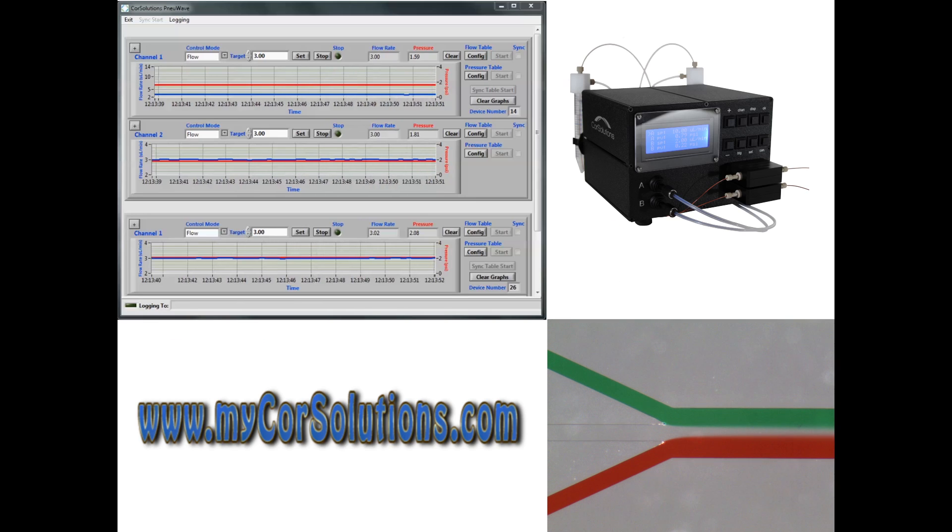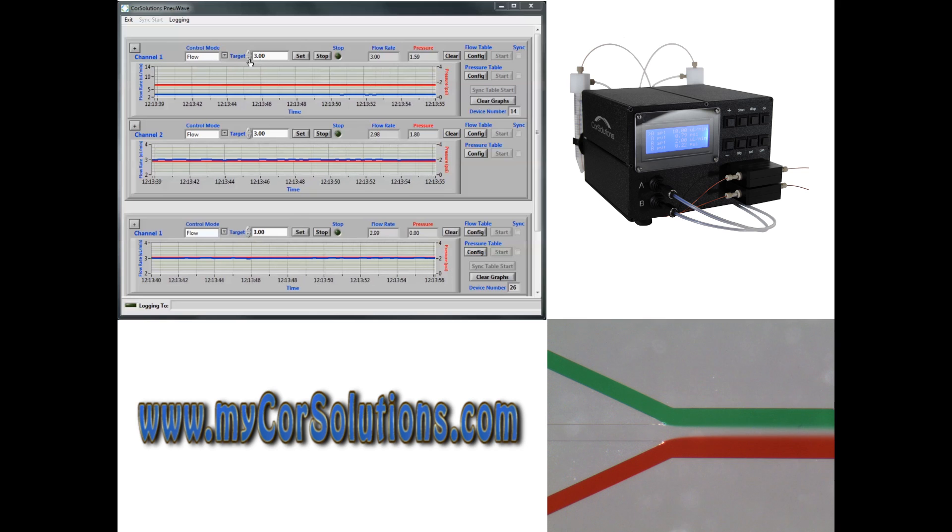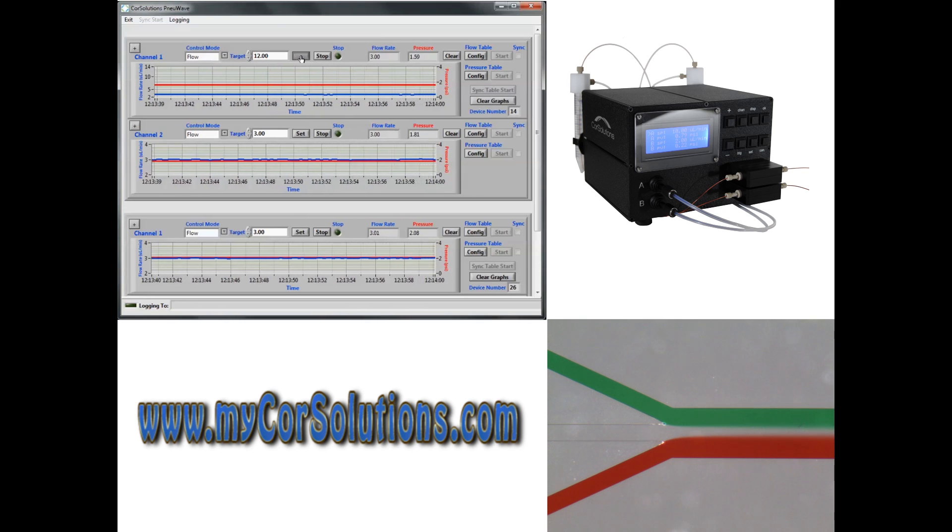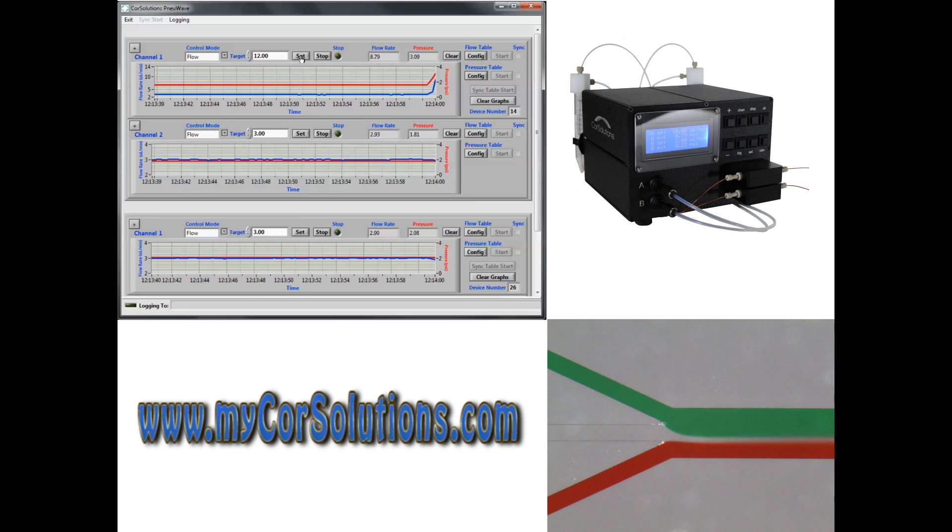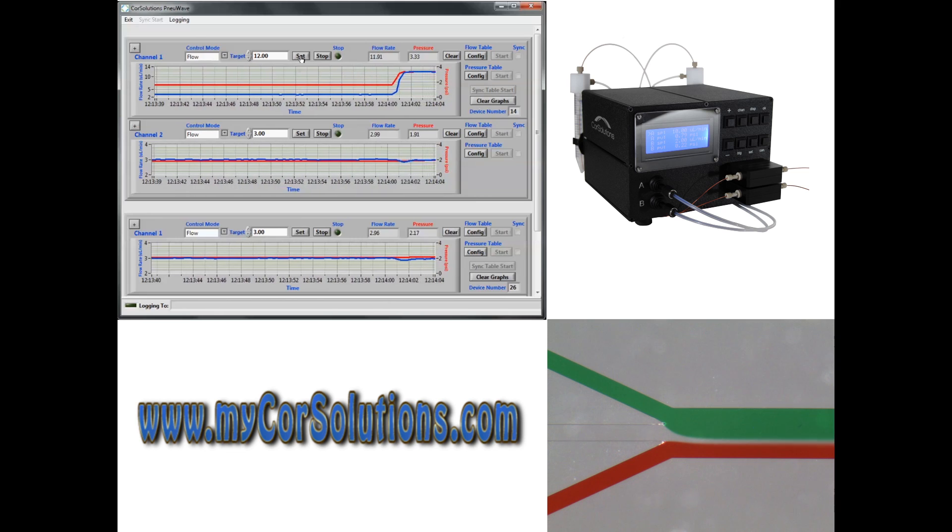This video demonstrates the benefits of fluid delivery by flow control with fast feedback. In this example, three fluid streams are being delivered simultaneously using a Core Solutions new wave pump operated in flow control mode.